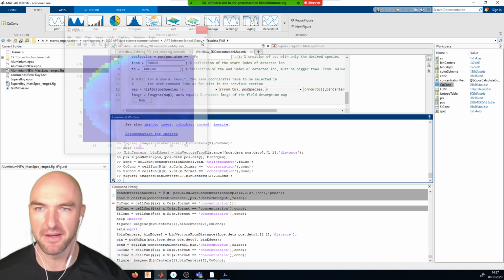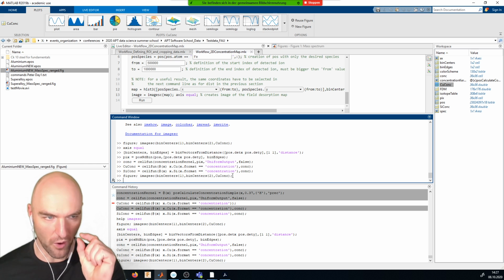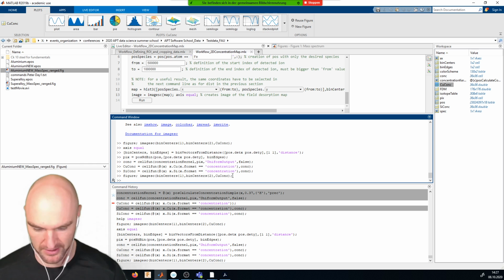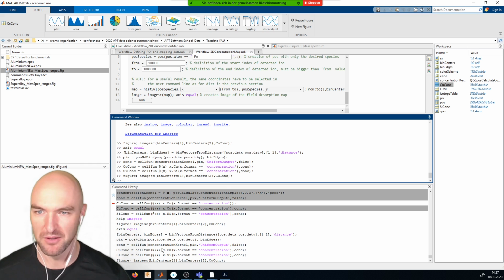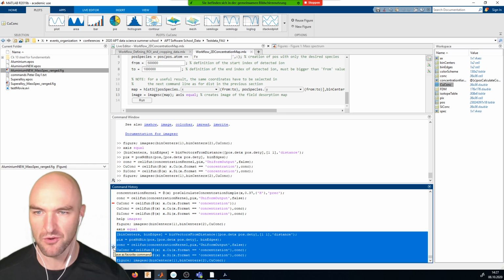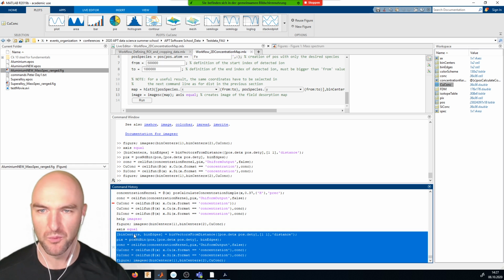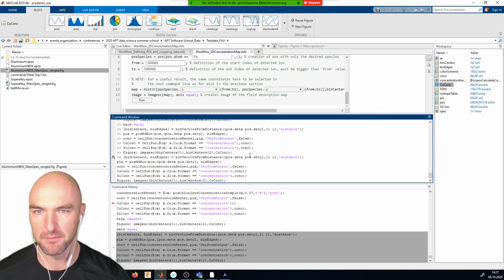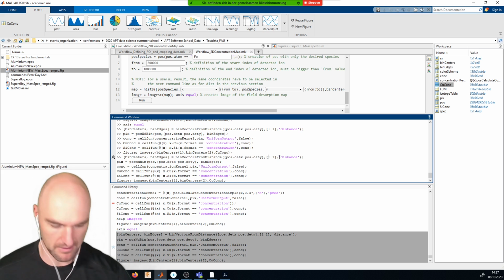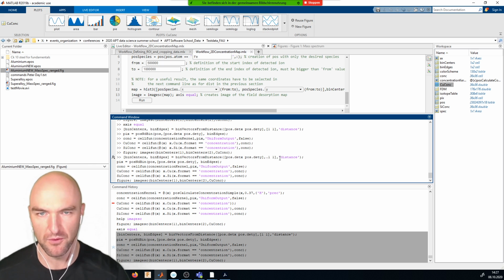Oh, obviously the bins in this case. Sorry, let me just change the bin size. Now we made it 1 millimeter on a 40 millimeter detector. That's not particularly effective. Now a little trick. If you do the same thing more often, one thing you can do is create a favorite. You can set that as a favorite command, so that you can just essentially autocomplete the whole block. I will not be doing that right now, but I'll move the whole block up here and make it 0.2 and 0.2, just like we had before.